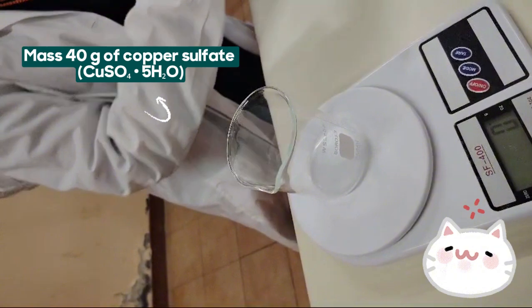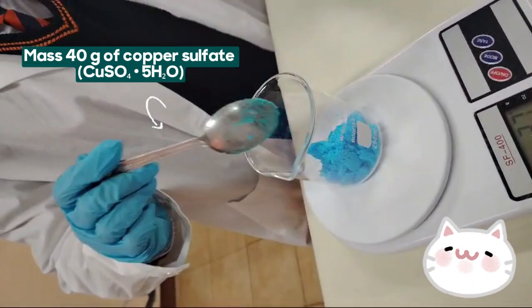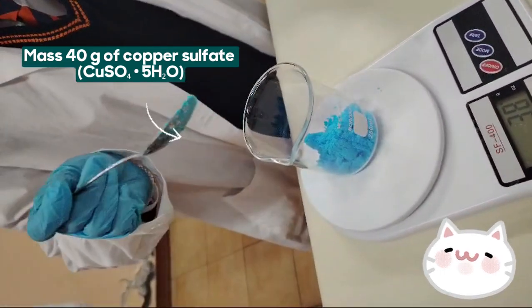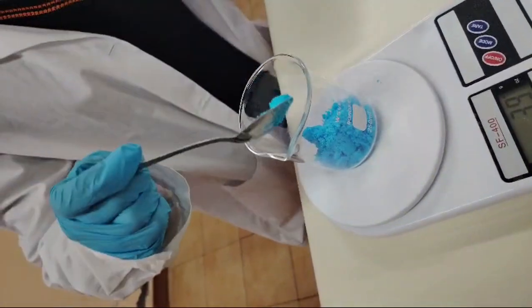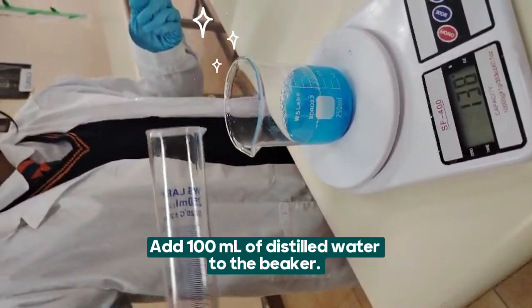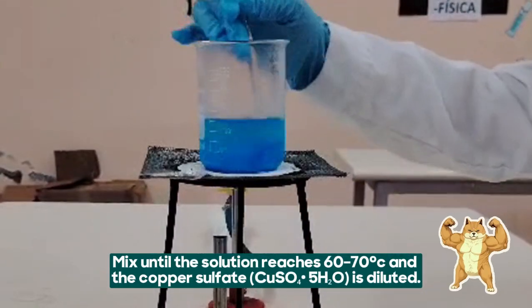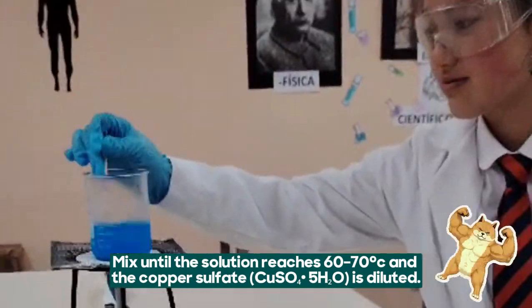Mass 40 grams of copper sulfate. Add 100 milliliters of distilled water to the beaker. Mix until the solution reaches between 60 and 70 degrees and the copper sulfate is dissolved.